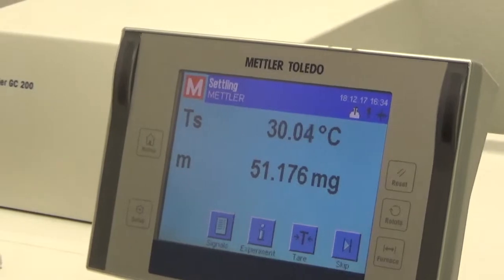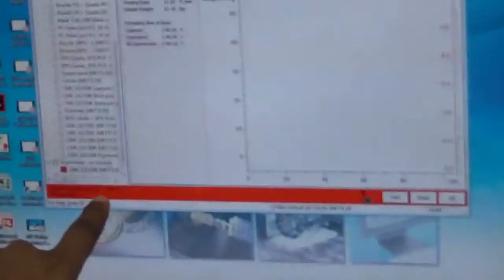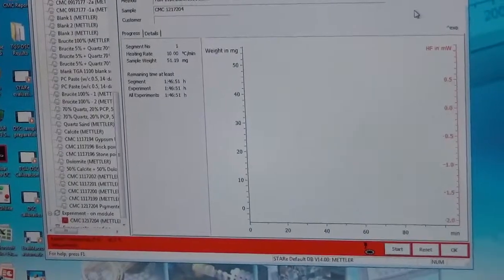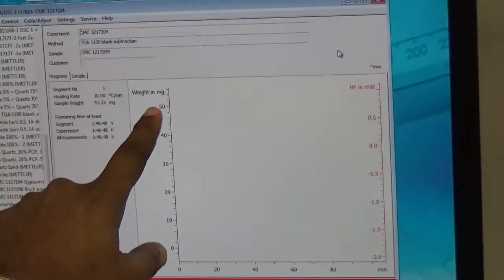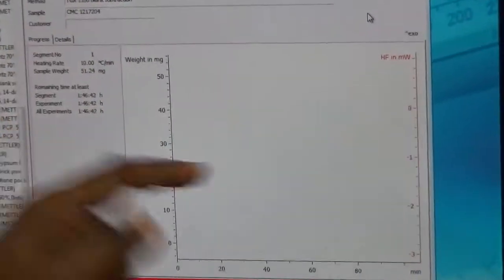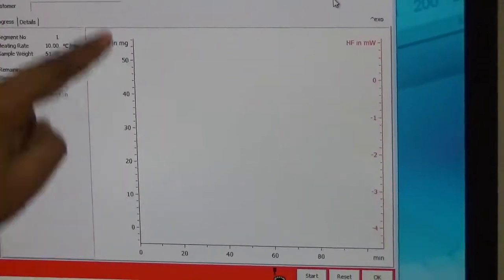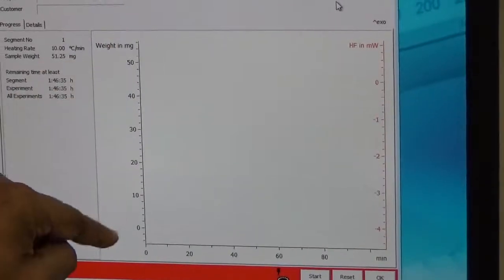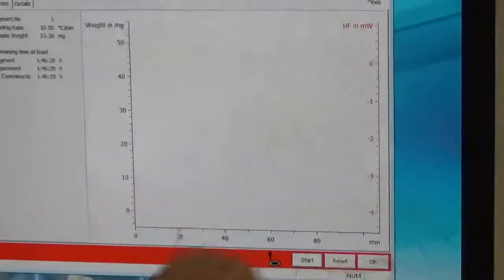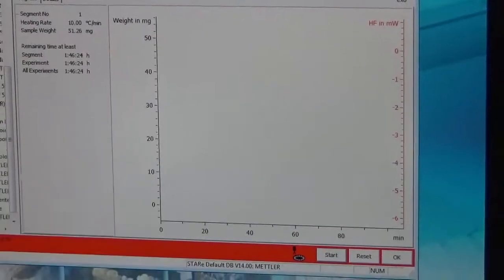Once this experiment starts, it is telling 'settling' and then 'measurement started,' because it already reached the 30-degree starting temperature. Pretty soon you will see a red line of the TGA curve as well as the DSC, both will show up. This axis shows the heat flow — the DSC curve; this axis shows the TGA — the weight change with temperature. The TGA and DSC curves are shown side by side. As the experiment progresses, you will see both curves and how they change.